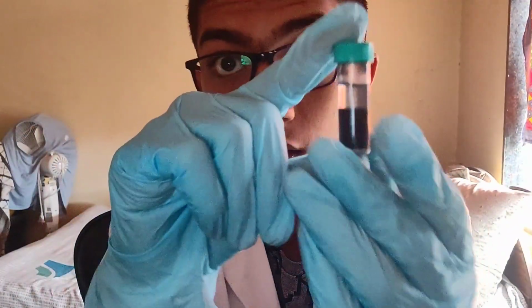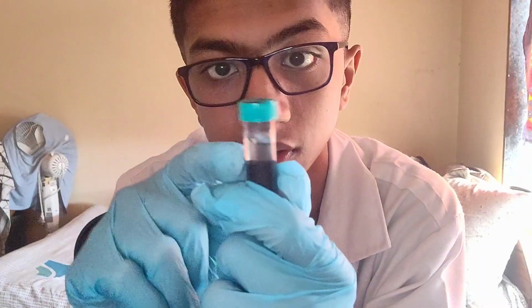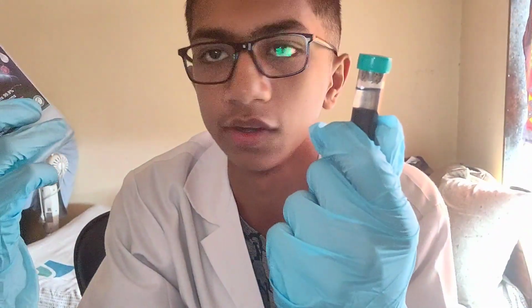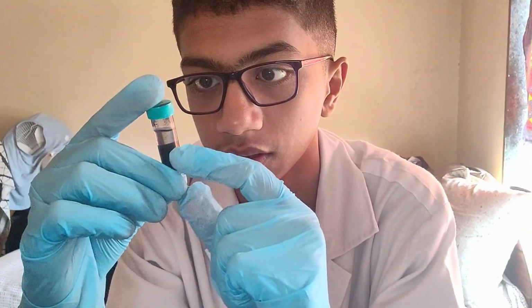And this was the 5% solution, I guess. Yeah, this one is the 5% solution. This is the 10% solution. Same thing is happening here too. It's a bit more tinted in blue. I think there's a much higher concentration of ethanol here, because the ethanol that I'm using comes from a sanitizer bottle since it's readily available. As you can see, it has a blue color, so the concentration must be higher here too. Or maybe I could be wrong. It could be something else.